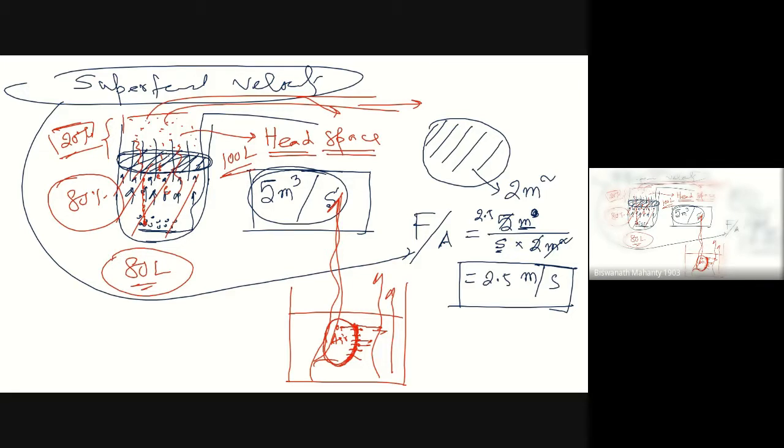For example, if I do not need much aeration, it is a very slow culture. I can put 90%, I can fill it also. No problem, because I do not have any aeration. So the liquid is not mixing so much, and you have an agitator also, right? If it is completely filled, then agitation will not be good enough, because agitation will cause some liquid column, right? A vortex will be formed. So I need a little bit more height also.